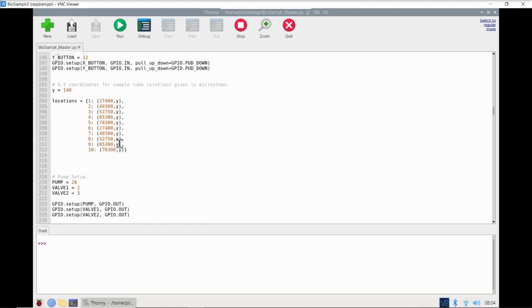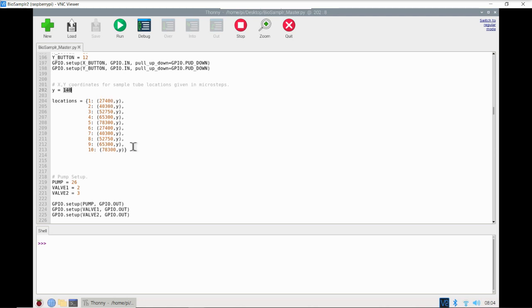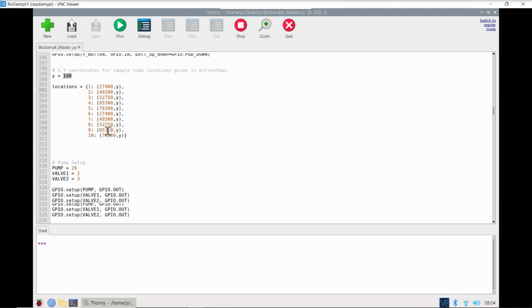In this next section, we define the coordinates of our sample tubes. The x-coordinates are all different, and the y-coordinates are all the same — set at 140 currently. The needle is normally vertical between the two rows of sample tubes, rotating in one direction or the other by the same amount, which is why the y-coordinate is the same. If you wanted to change the locations of those sample tubes, you would change these numbers here.